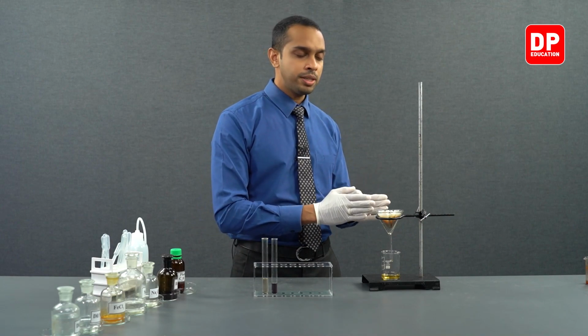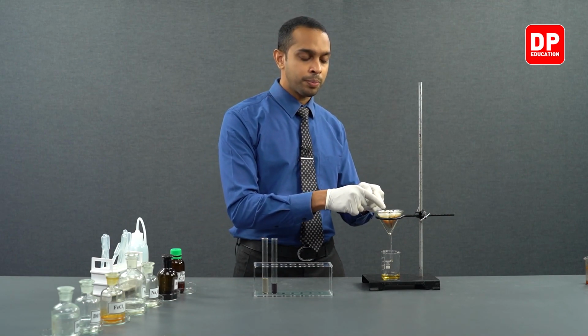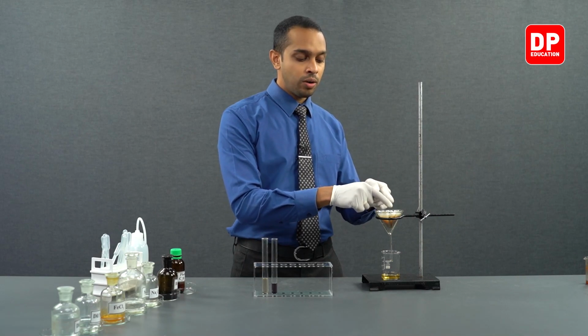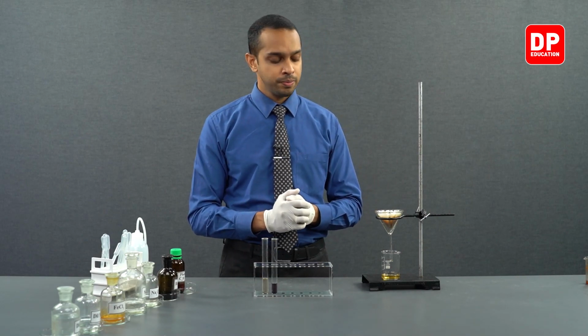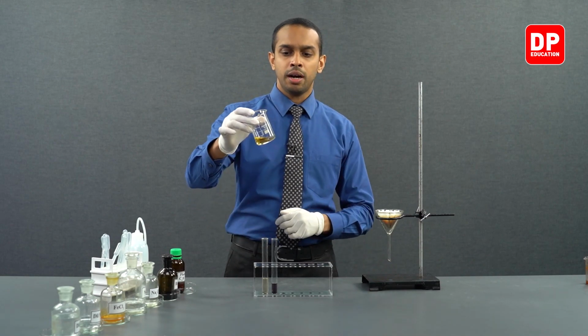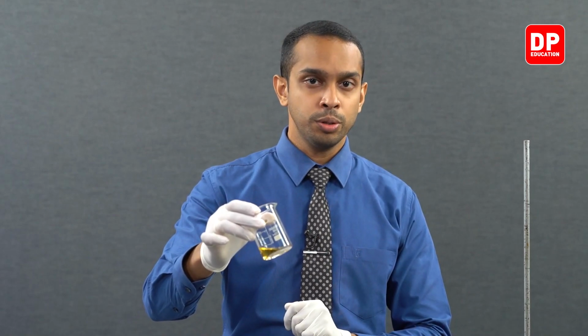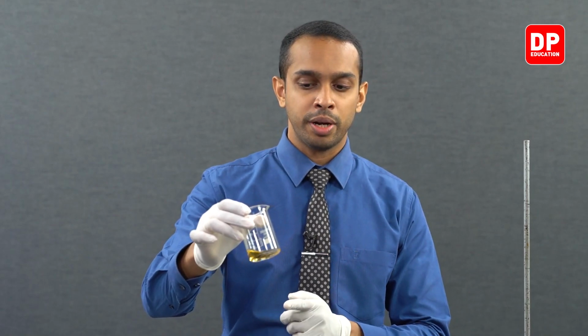Afterwards, we filtered the suspension and we obtained our brown color precipitate, ferric hydroxide, on the filter paper, and as the filtrate we obtained our ferric chloride neutral solution.